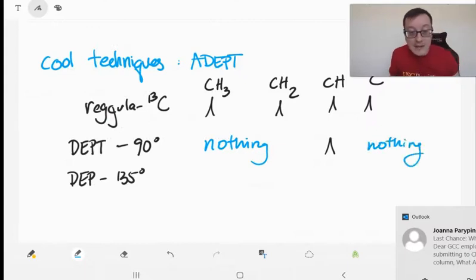You only see CHs because they're the only ones that are going to show up at a 90-degree angle. Don't worry about why. Just accept it. The different detectors placed at different angles just receive different signals, and putting those together lets you see CHs separately.